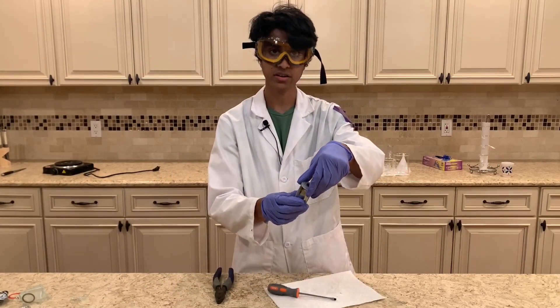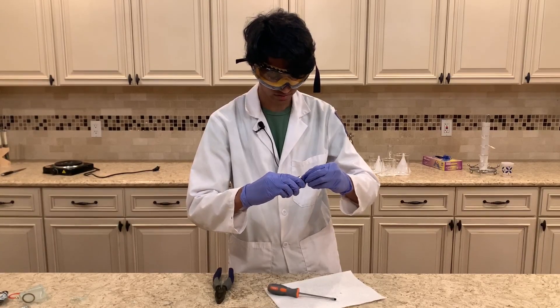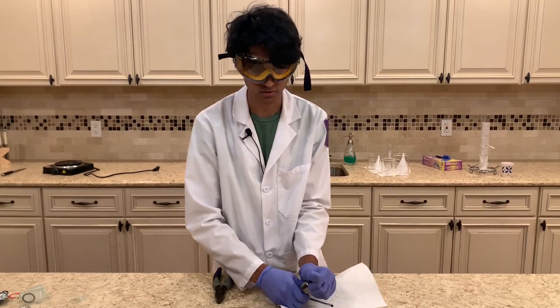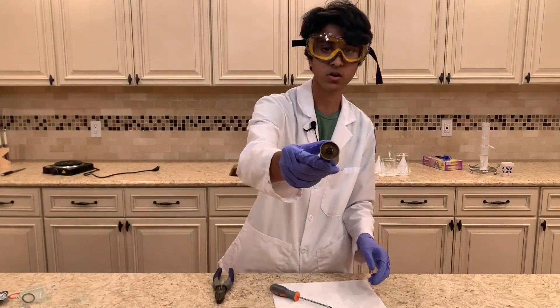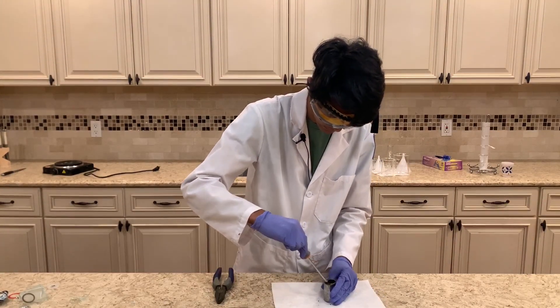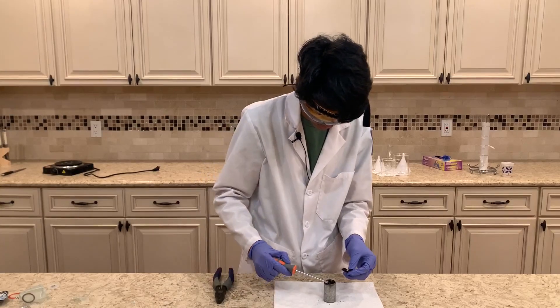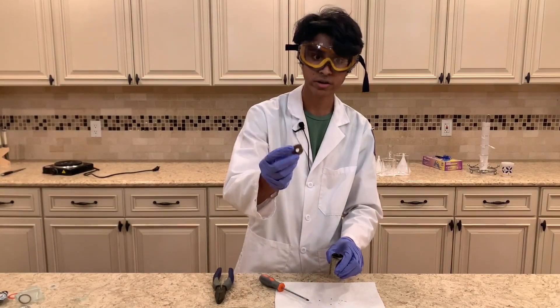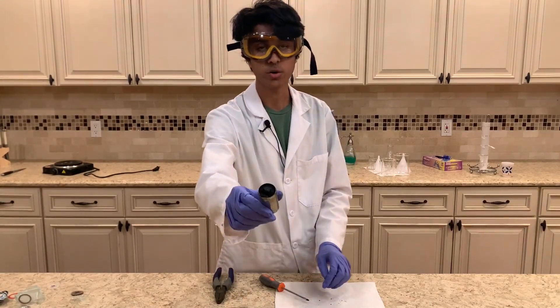Now this is the zinc outer coating, and what we need to do is take the cap off on the top. I got it out, and now there's a cardboard layer that we'll have to use the screwdriver to remove. I took the cardboard layer out, and the next step is going to be to take out the carbon rod in the middle.